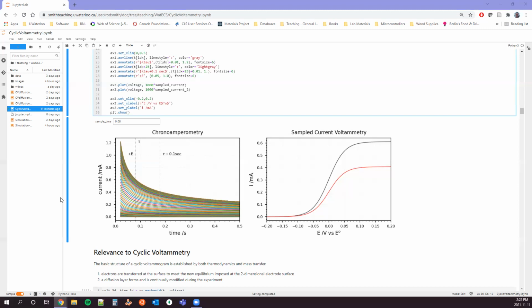It varies. With modern equipment, you can measure down to nanoamps if you're in a controlled environment, even lower sometimes. And so you can measure very small concentrations. Electrochemistry is exquisitely sensitive. It's really amazing how sensitive it is. But it comes down to control, right? And so the perks of using something like square wave voltammetry: in cyclic voltammetry, you change something once, right? So you do a sweep, you oxidize, if it's bound to your surface for example, you oxidize it and you're done, right? And so you count it once.